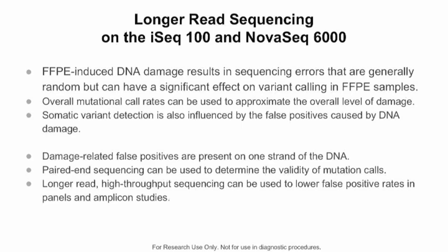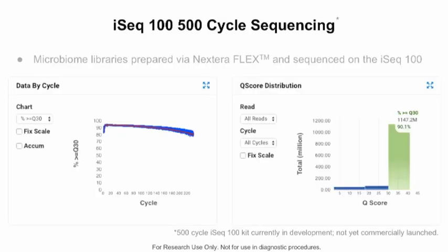So if you have the paired reads, you can very, very robustly tell them apart. So you can take a 250 or 300 base pair insert library and run it at paired 250, and again, intentionally run those in either direction. So we've looked at that on both the iSeq as well as the NovaSeq. Works pretty well, and some of the early testing we looked at was just to make sure the base quality stayed high on the end of the reads to make this a viable approach.